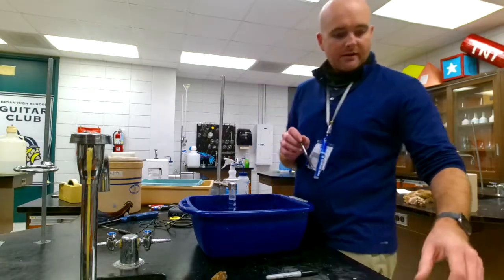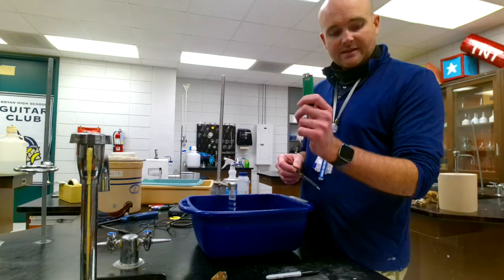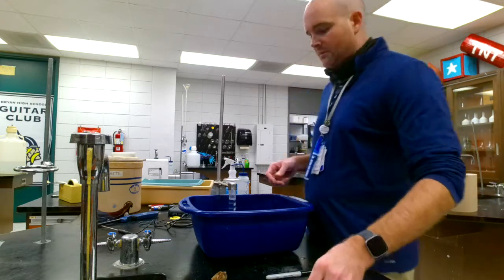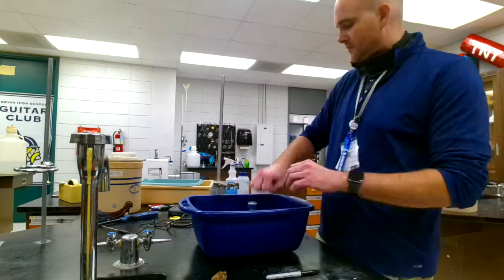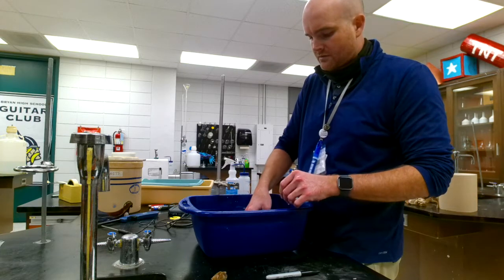All right, this lighter weighs 21.3660 grams now. We've taken off as much as we could. We are going to reset and try again. There was a small bubble in that one.